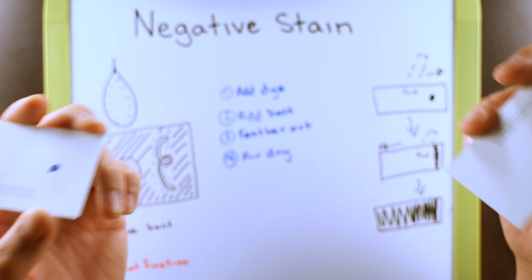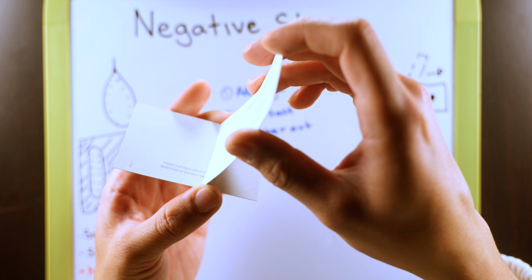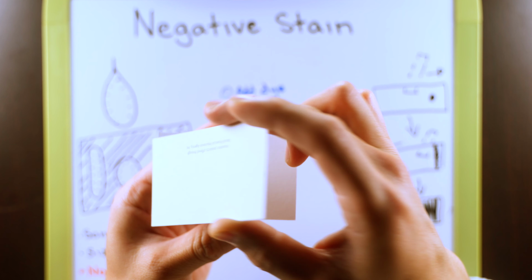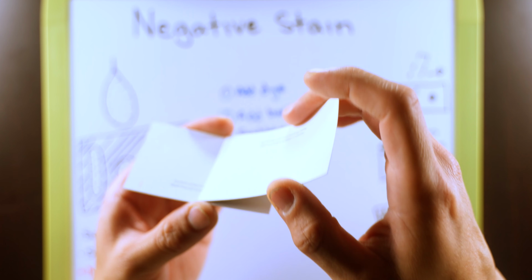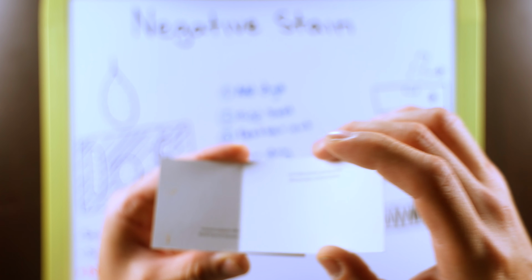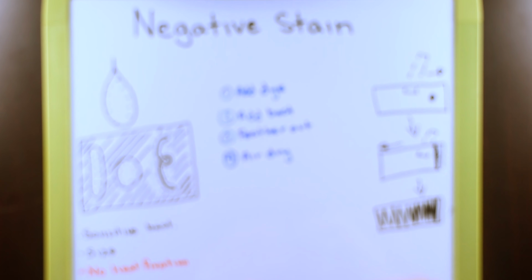So if you ever want to practice this technique outside of your lab, just take 2 business cards, draw a dot, start a little bit in front of that dot, like that, draw it back, wait for a second, and then push forward. You can hear the scraping of the 2 cards, and that's usually good enough. You don't want to have your card bend down. That means you're using too much leverage there. And if you don't hear that sound, like that, that means that your cards are not together. So this is a good way to practice your technique.